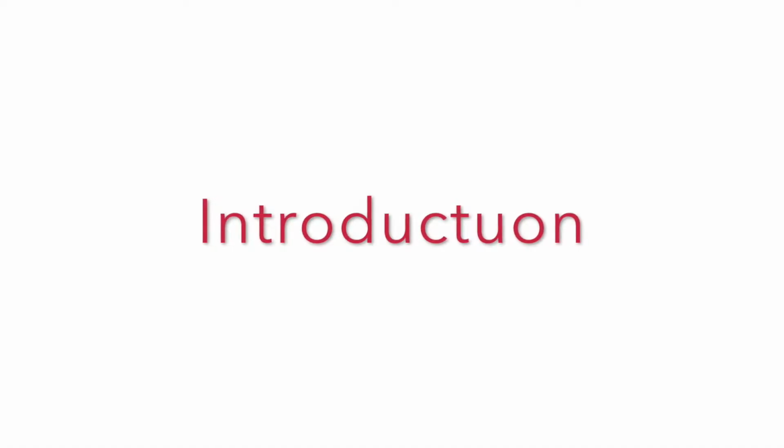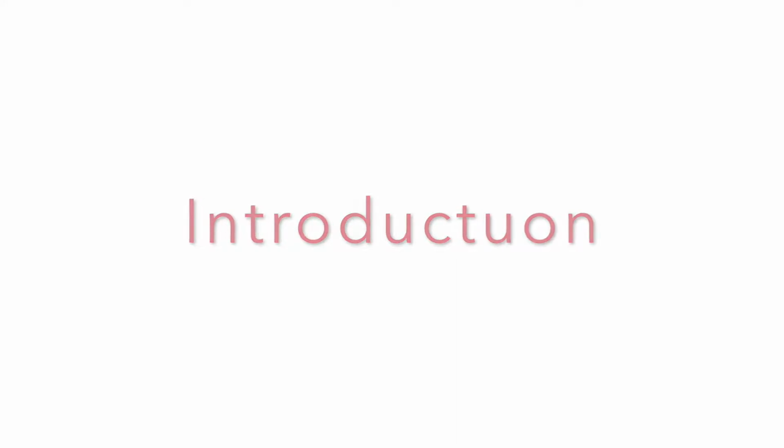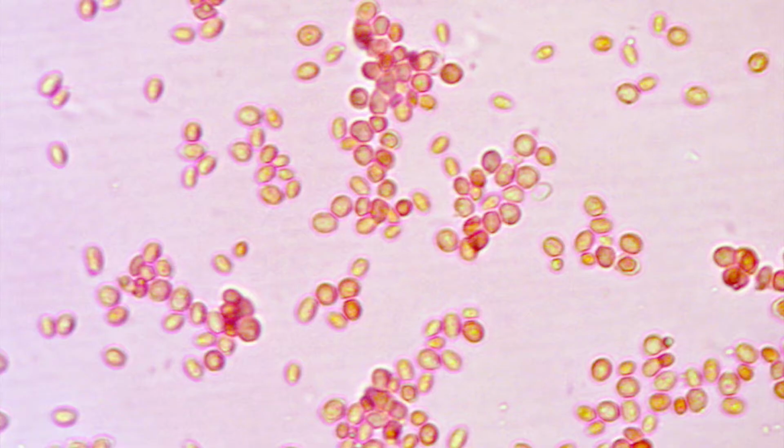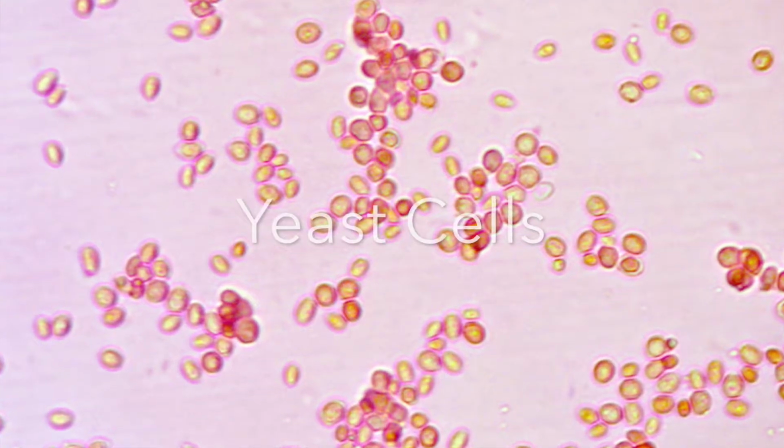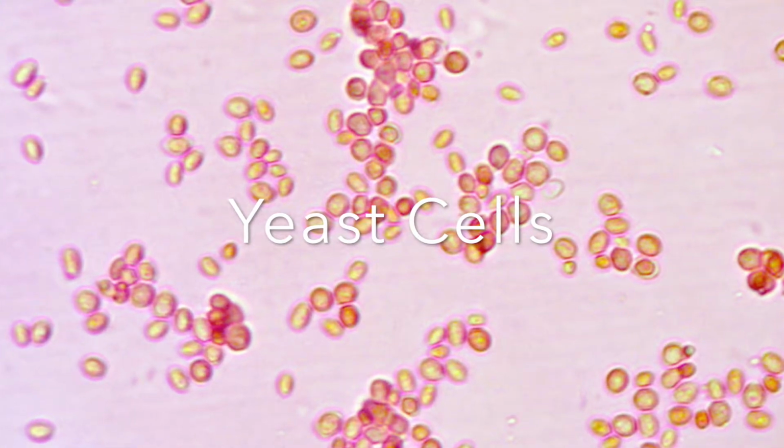In this experiment, I looked at the phenomenon known as complementation using various strains of yeast that have a mutation in the ADE pathway that causes them to be pink. Complementation is a phenomenon by which the effects of two different non-allelic mutations in a gene are partly or entirely canceled out when they occur together.